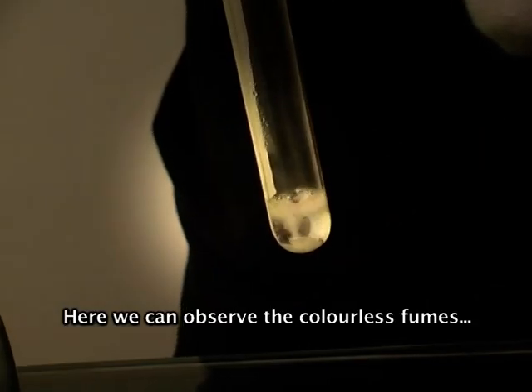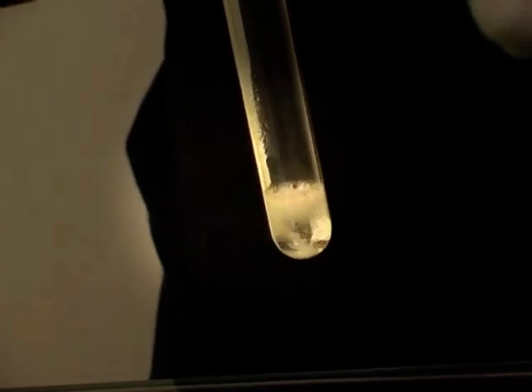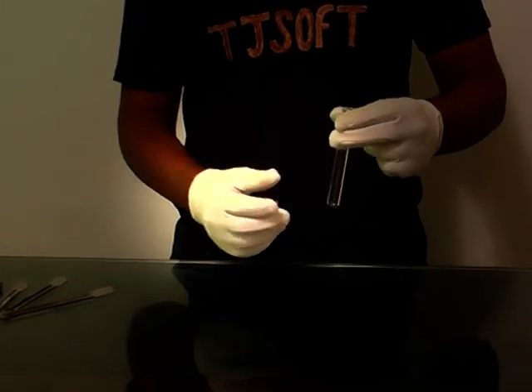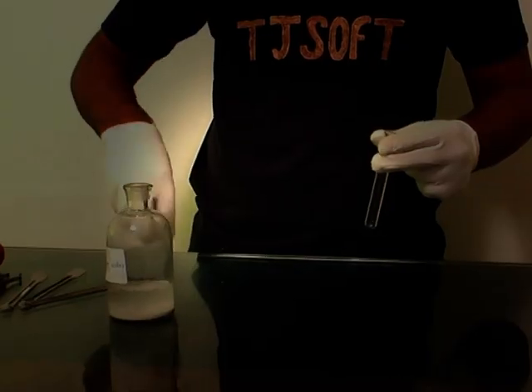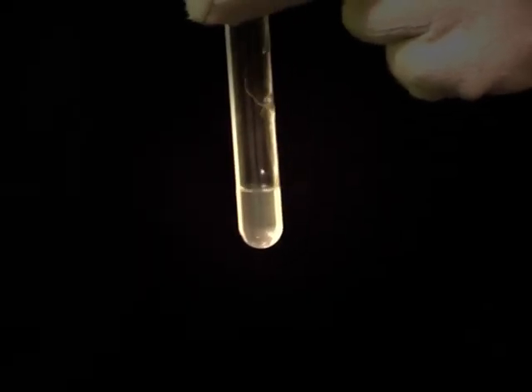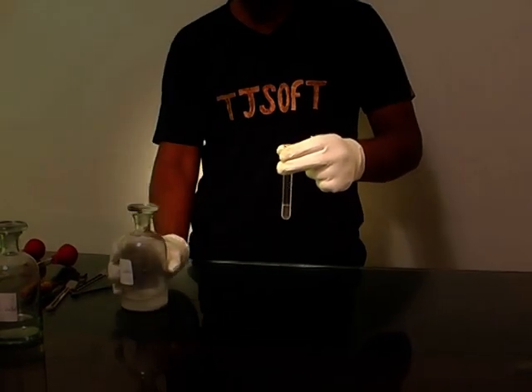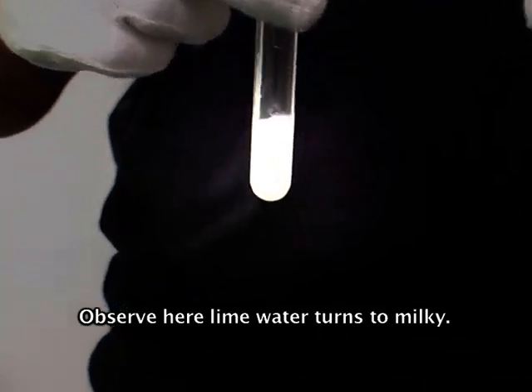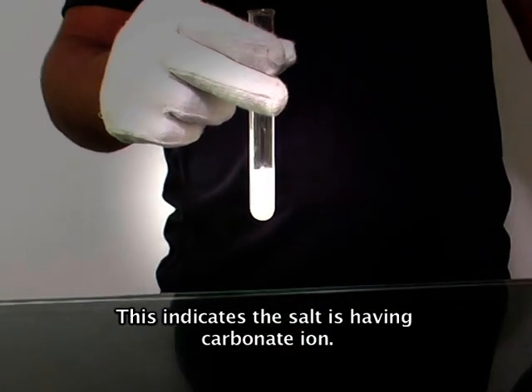Here we can observe colorless fumes with brisk effervescence evolving from the test tube. Now take another test tube and add 1 ml of lime water. Pour this mixture into the lime water. Observe here — the lime water turns milky. This indicates that the salt contains carbonate ion.